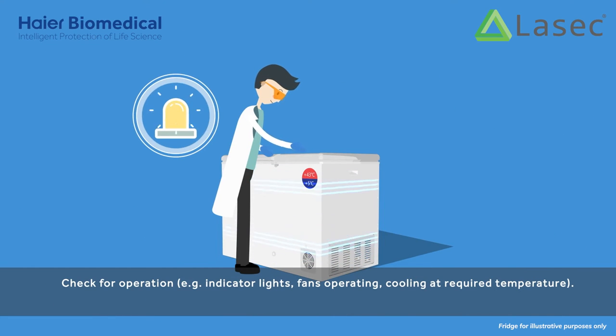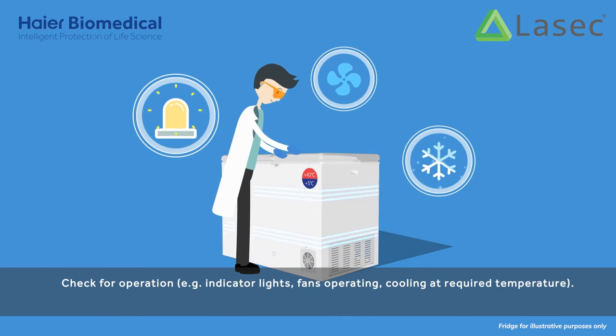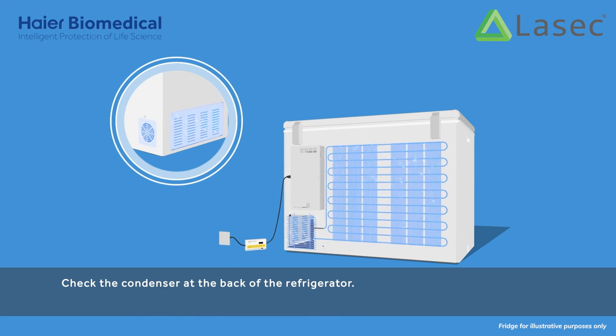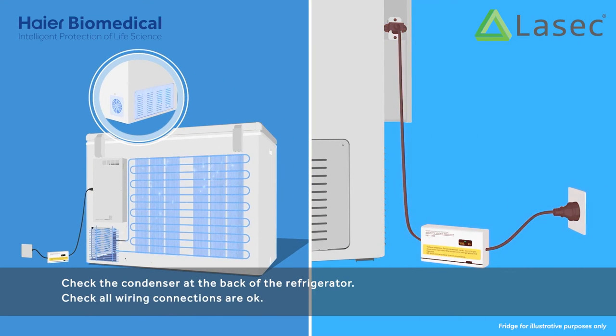Check for operation — for example, indicator lights, fans operating, and cooling at the required temperature. Check the condenser at the back of the refrigerator. Check all wiring connections are okay.